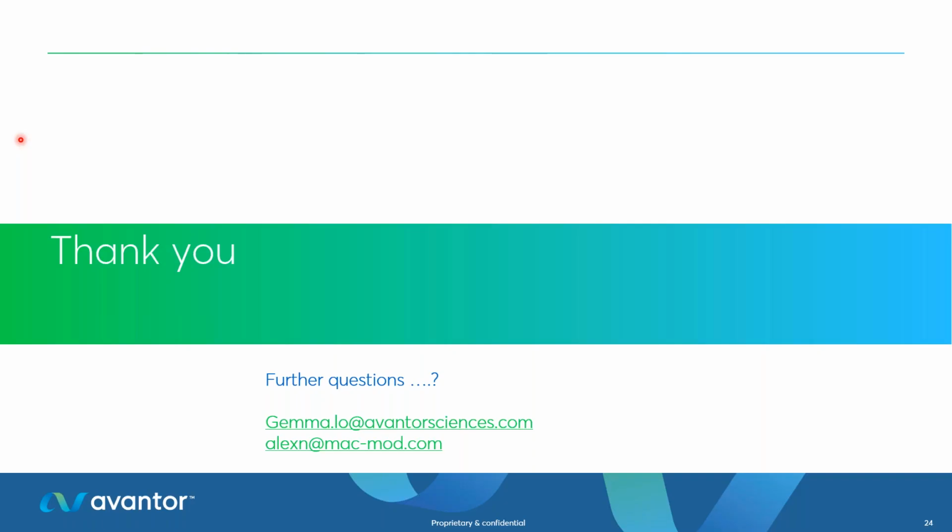First question, are there a different number or a certain number of chemistries that you recommend when you're starting a method development project to try? That's a really good question. We've worked with different companies over the years who have had different strategies. We tend to use 6 more because our instrument can take 6. So we've got a 6-column screen, and that's what we utilize.